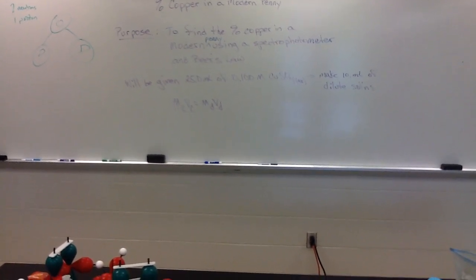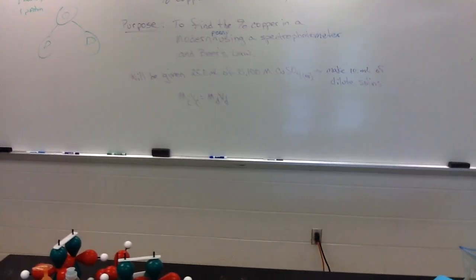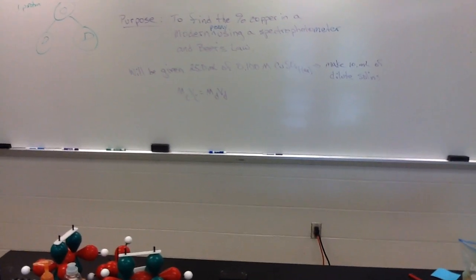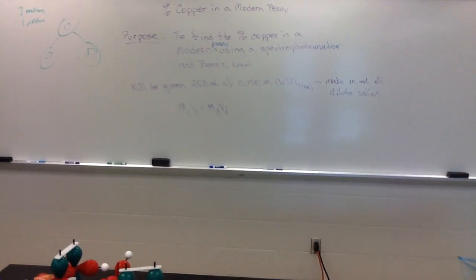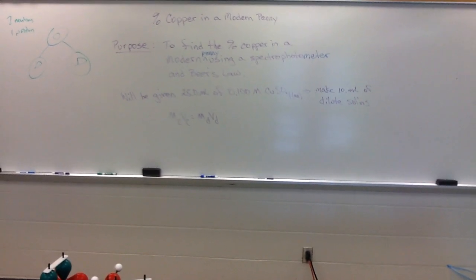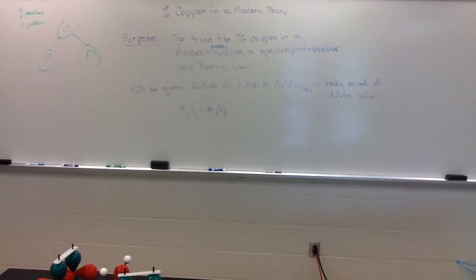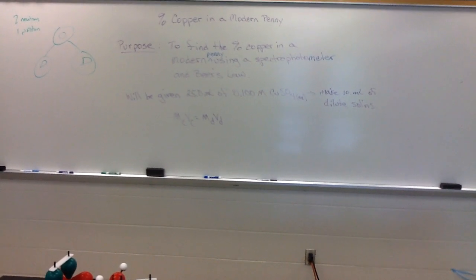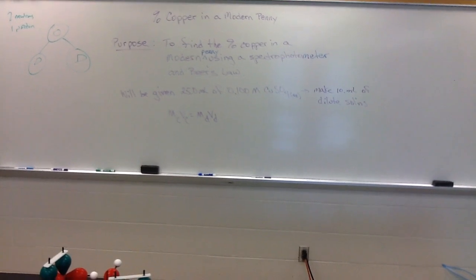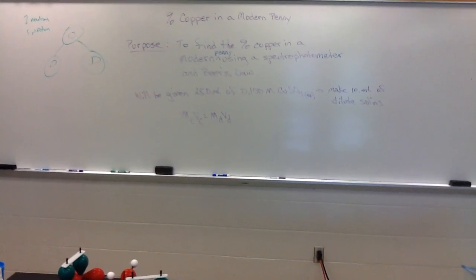Okay? So in the first experiment, in the Beer's Law experiment, you had to make your 0.1 molar standard solution. I'm using the leftovers from that lab, and so you're going to have 0.1 molar CuSO4. They're making dilutions, 10 milliliter samples of a certain number of dilutions. They get to choose how many they are actually doing. I'll send you a picture of the actual data table once the lab is complete. Okay, so they're going to make the dilutions.